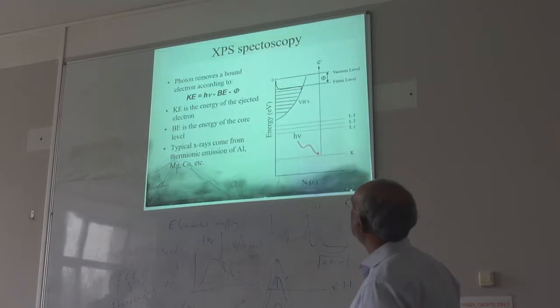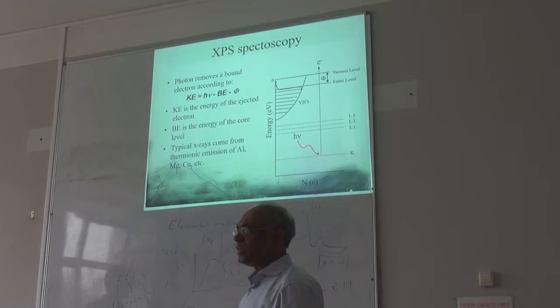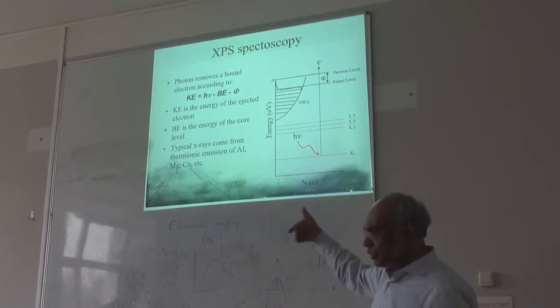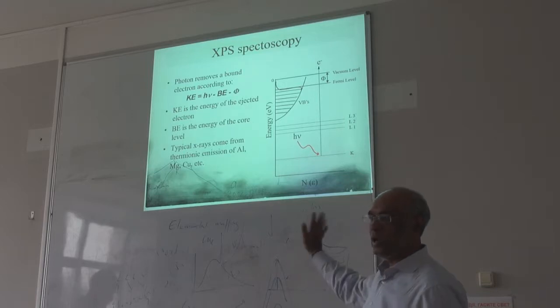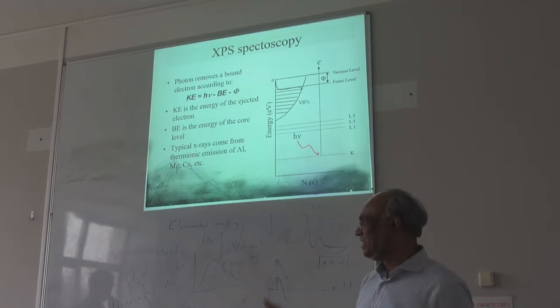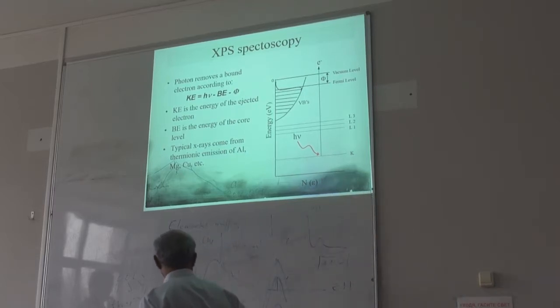This is mostly used for surface characterization. XPS is basically where you use X-ray light. So now, nothing about electron microscopy. That is a new thing. We are done with electron microscopy now. So now we are going to talk about surface characterization.